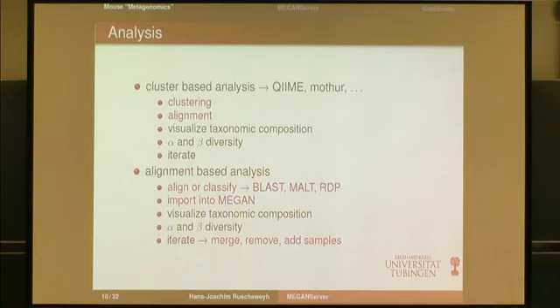Iterating can be painful. Of course, we are talking here only about 1.2 million reads, so it's teeny tiny. But if you go to metagenomics, we also have samples on the web server which have altogether 250 million reads, and it's like 300 gigabytes of space. So iterating through that kind of data in terms of merging, removing, adding samples, if you're working on the file system level, is kind of painful.